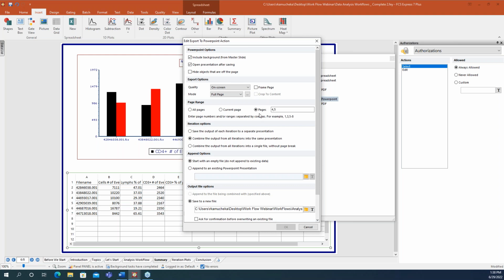So this is a big workspace because I'm presenting from my workspace. That's another way that you can really maximize efficiency. If I have to do a lab presentation, I don't necessarily have to create these. I can just open up my FCS Express and walk through my workspace and kind of give the explanation of what I'm doing and how my analysis is going.